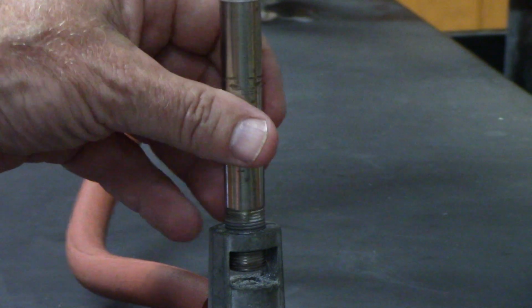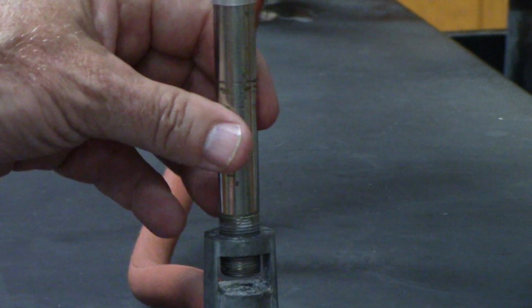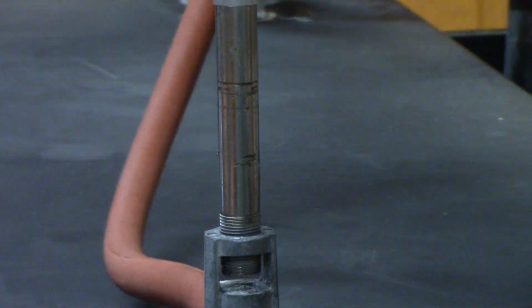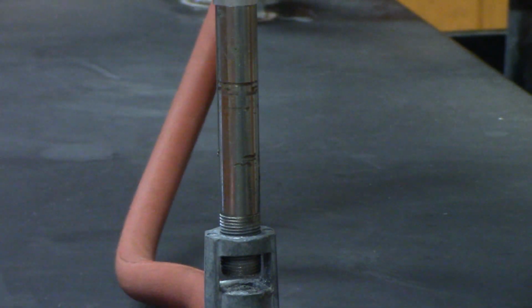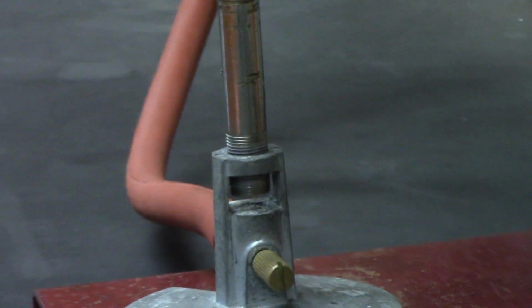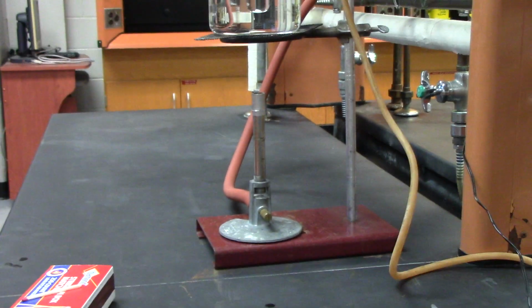If you have it closed, nothing's going to happen, and actually it can be dangerous. Your air comes in through there, and this is my gas valve. Let me back up and show you how I'm going to do this.